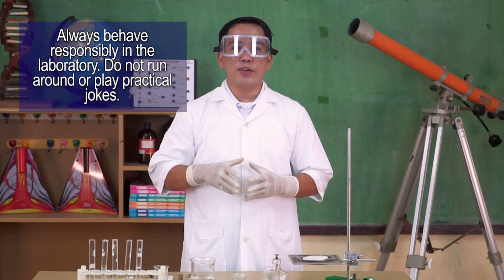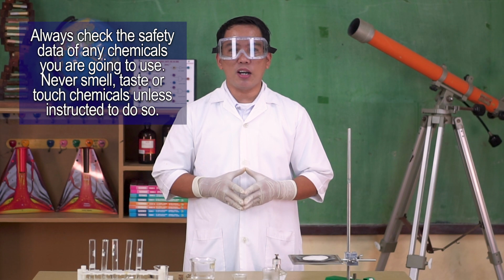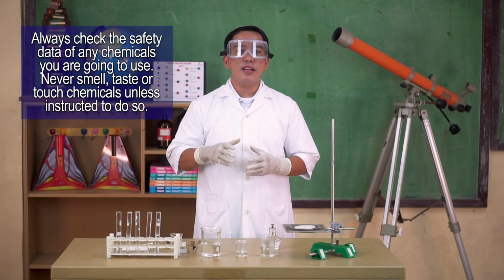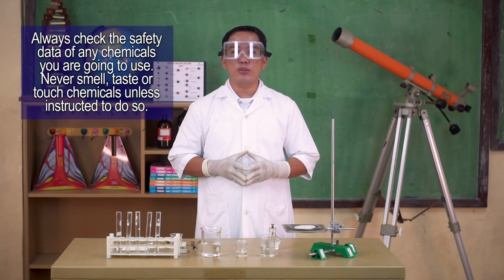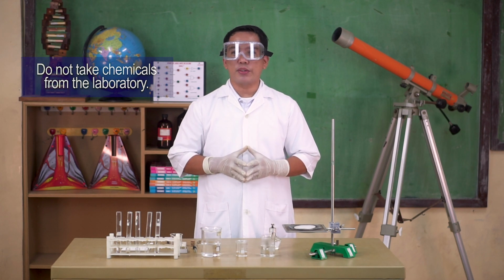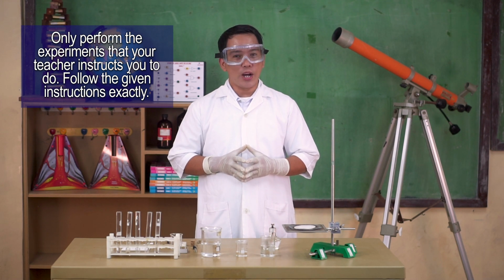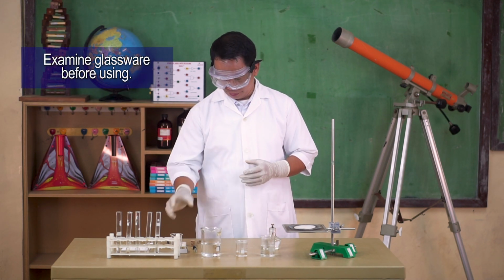Do not run around or play practical jokes. Always check the safety data of any chemicals you are going to use. Never smell, taste, or touch chemicals unless instructed to do so. Do not take chemicals from the laboratory. Only perform the experiments that your teacher instructs you to do. Follow the given instructions exactly. Examine glassware before using.